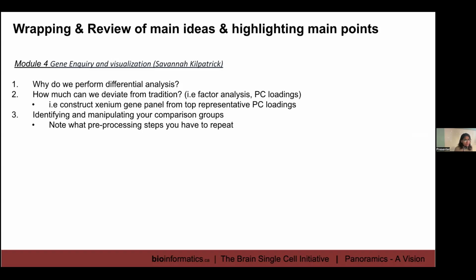You can do that. For most of you who have done single cell experiments, that's what we used to do, right? We used to do clustering, PCA clustering, and then we would divide up the cohort into immune and tumor or normal cells, and then we would subcluster again. So before you do any kind of differential analysis, also bear in mind what your target groups or target cell types are, and then subcluster them and then investigate them.